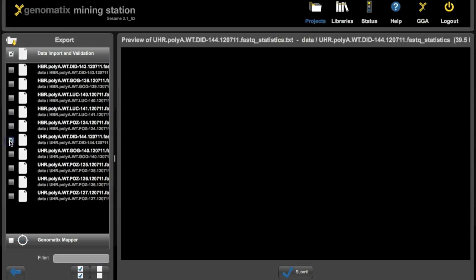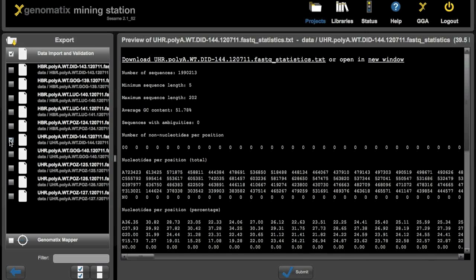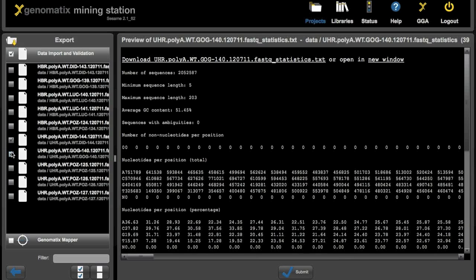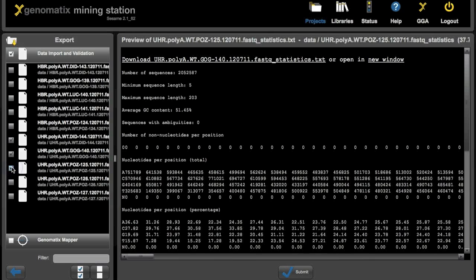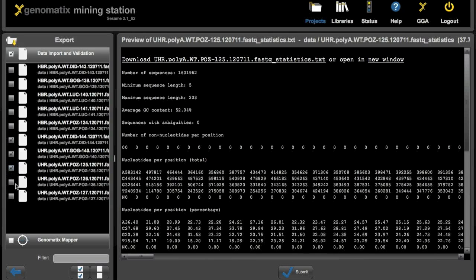So for example if you want the read statistics where we saw the histograms and curves before, you can select the statistics files for any of the sequence files that you imported. As you can see to the right you get a preview of the file that you select.